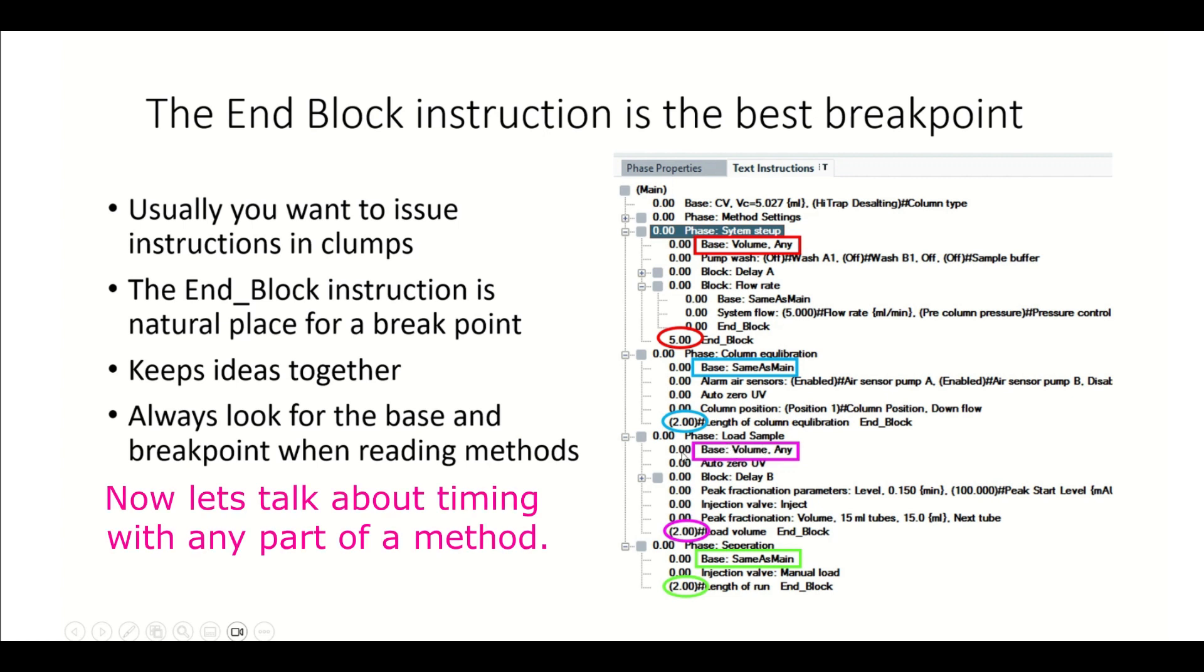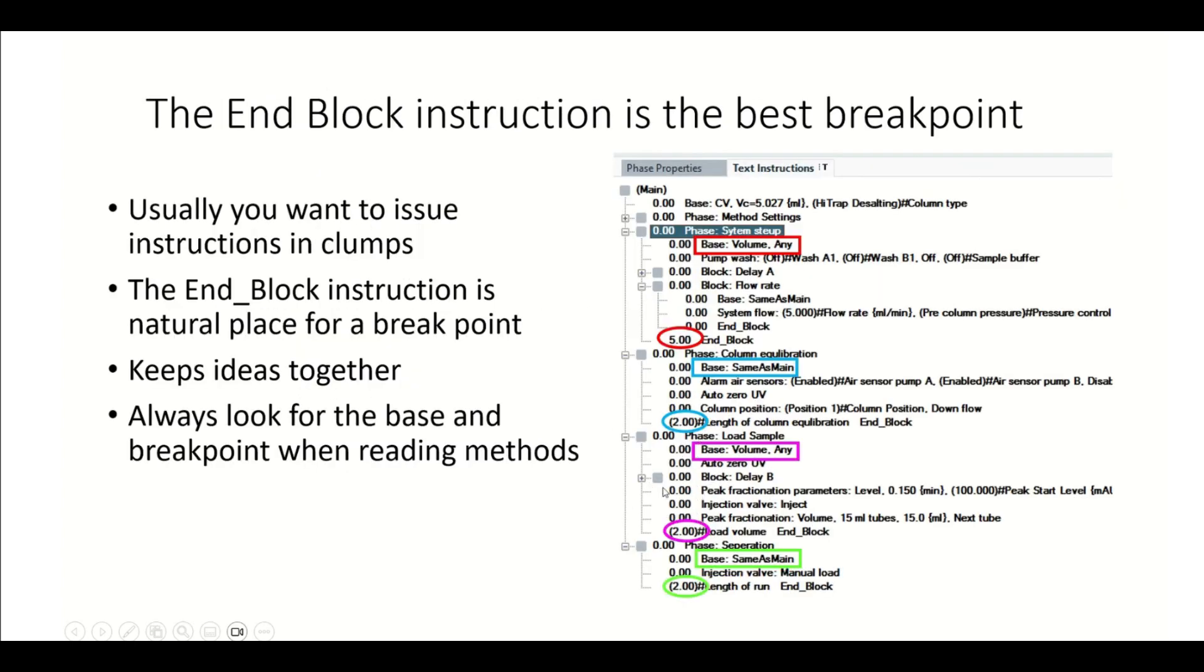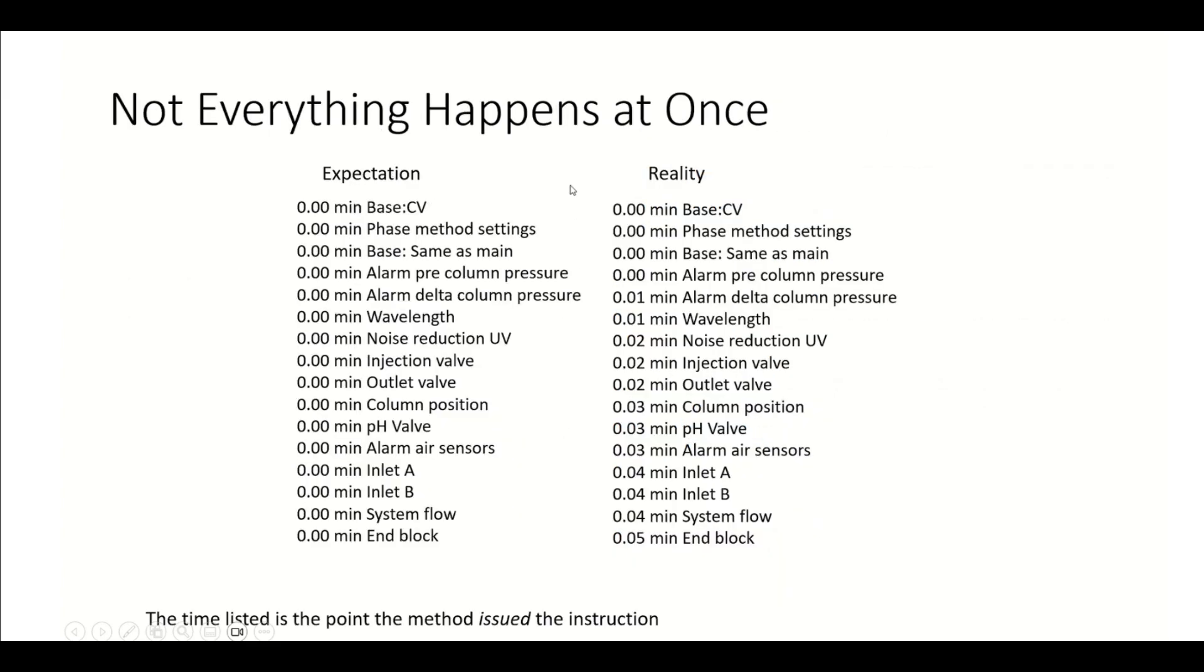So there's a bunch of zeros right here. We kind of expect that we read this base instruction all the way down here to this peak fractionation instruction. All of it would be read at once except for this delay instruction here. That's kind of obvious what a delay would do - it delays stuff. But we'd sort of expect it all to be read at once. But that's not really how things happen. Everything does not happen at once in Unicorn. We'll worry about the delay block in just a minute. What I want you to focus on is, for a method settings start, we would expect that because it's all zeros, everything would happen at once. From the log book, we get something that looks like this. Notice there's this minutes here. That's because that's how it appears in the log book here. This is how it's written in the method editor. There's no minutes in between the break point and the instruction. This is how it's written out, but this is what happens in reality. So at the very end here, it's 0.05 minutes. That's metric time, three seconds. That's how long it takes to read this method settings phase.